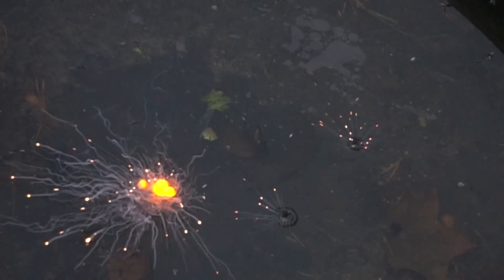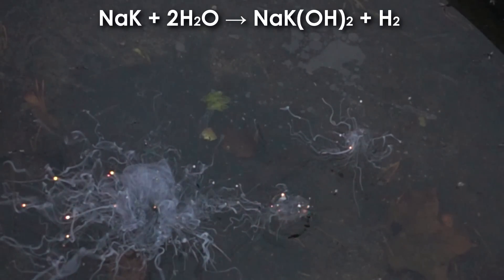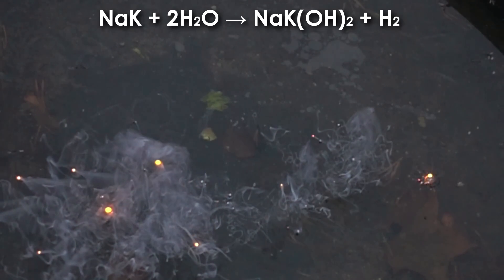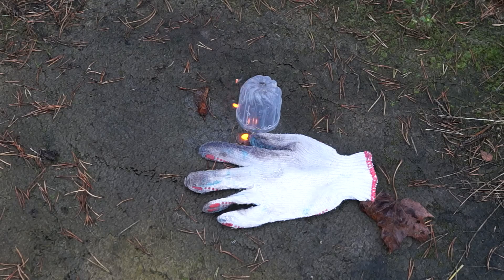As can be seen, the alloy instantly ignites in water from burning droplets. If you drop this alloy on a wet surface, the alloy will also light up — sometimes with an explosion.